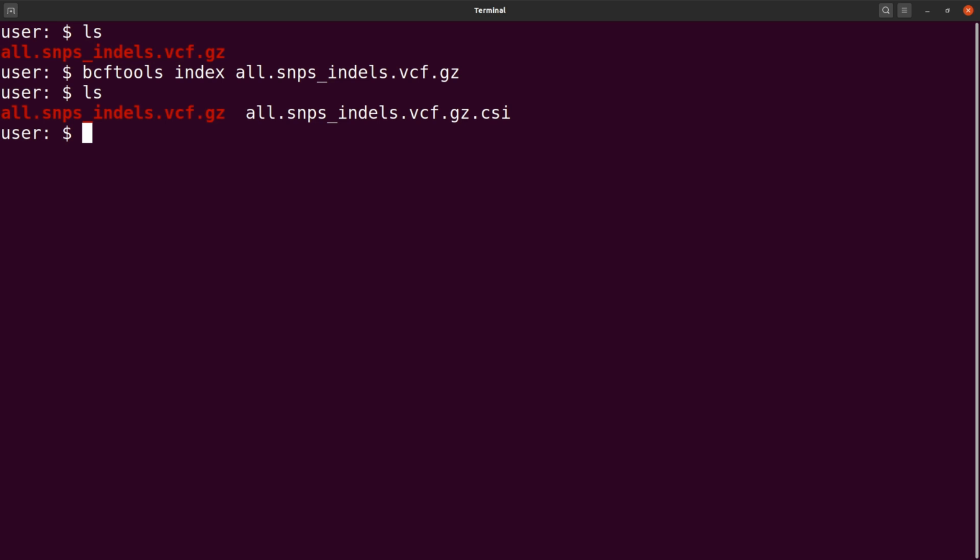So to do that, we need to first list the chromosomes. We will display them and then continue. So to get the chromosomes, we say bcftools query -f. We open a quote, have this percentage symbol, and then CHROM, and then we add \n. And then we specify the VCF file. So with this command, the -f here is format.